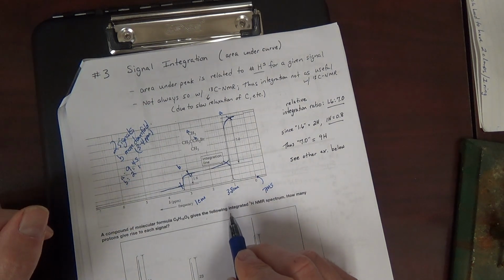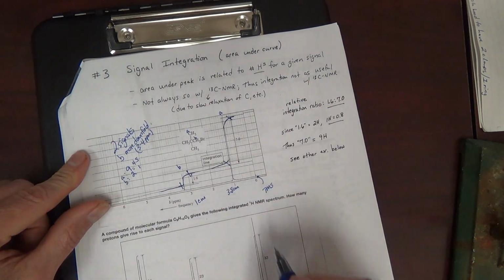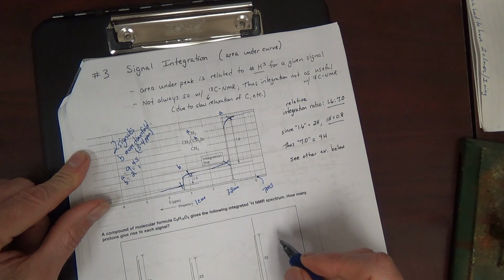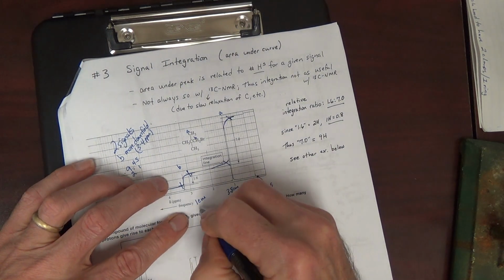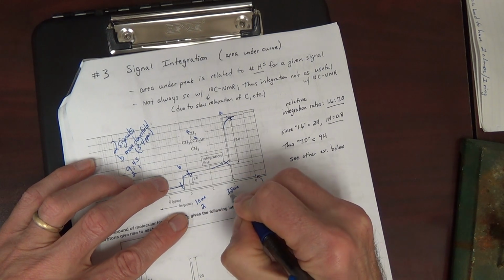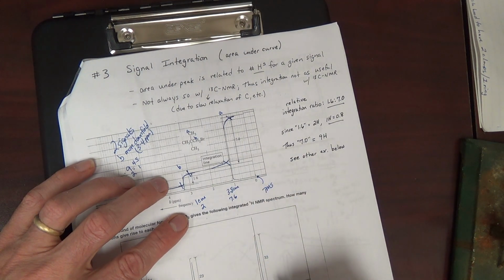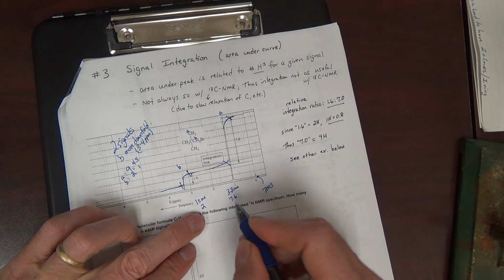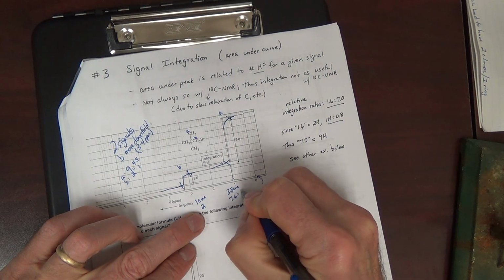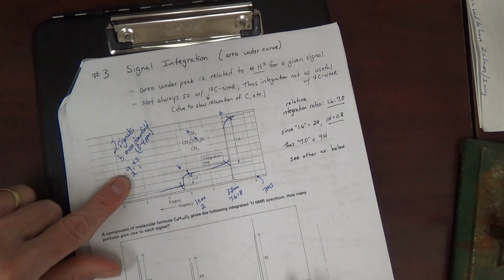Now, integration is not always going to be exact. Whenever I present this handout, I've never measured this before. I've never been sitting at my desk. But that's where you take this ratio, and then we can turn this into a number of hydrogens. And of course, this can become 2, and this can become 7.6. All right. Of course, you can't have 0.6 hydrogen, so maybe this is 2 and this equals 8, 2 to 8. The integration looks like 2 to 8 to me instead of 2 to 9.